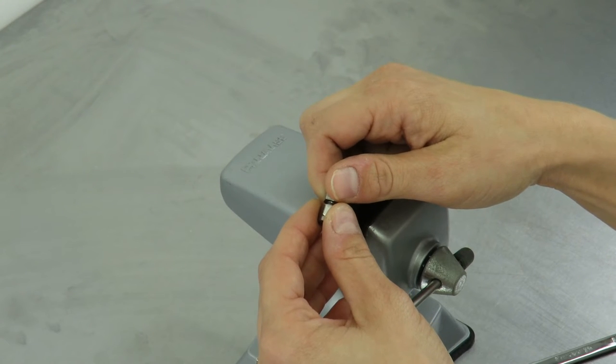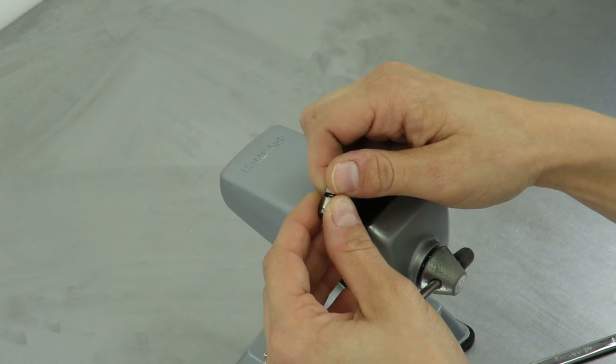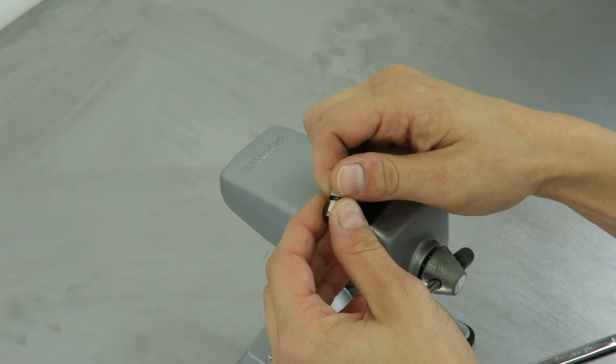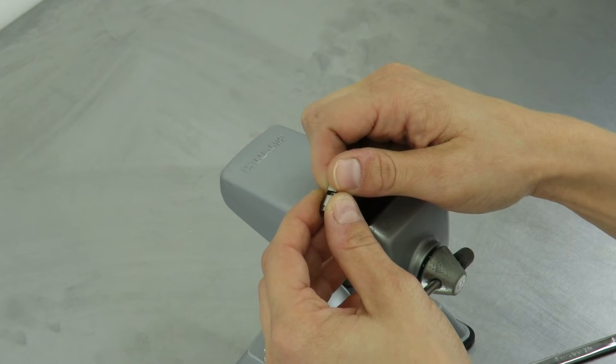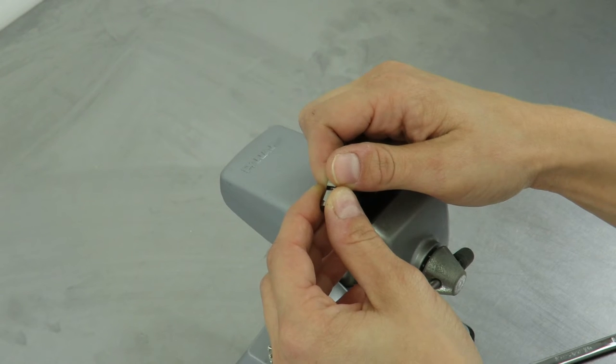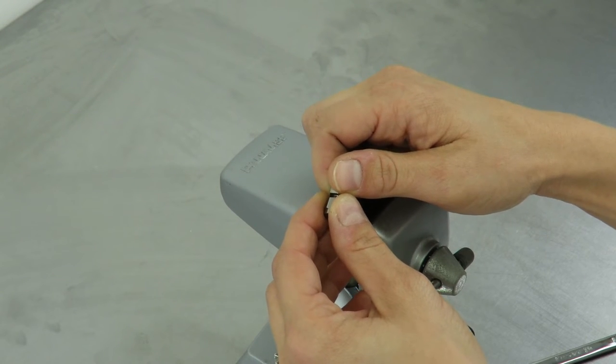Once you have your tubing, ferrule, and fitting, you can make your custom needle. We are using 20 gauge hypodermic tubing with a 1/16th inch adapter ferrule and a luer to 1/16th inch compression fitting to make a custom length 20 gauge needle.